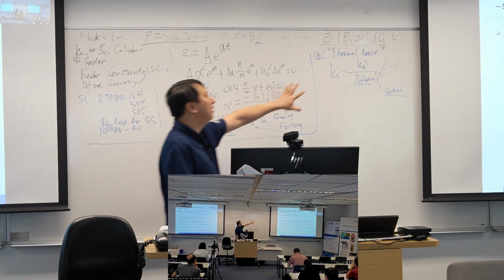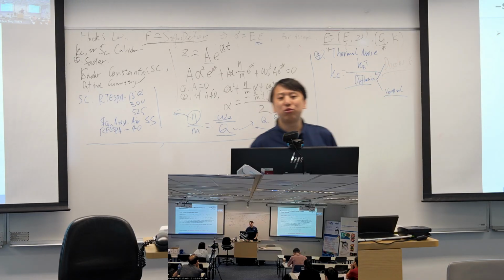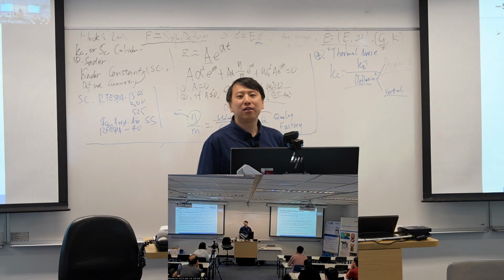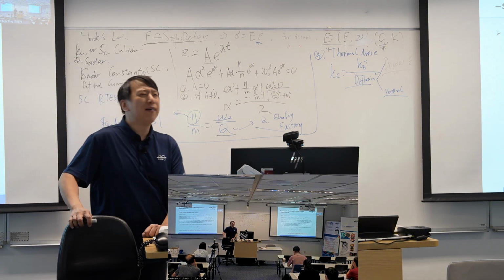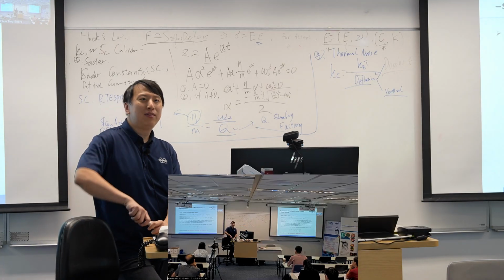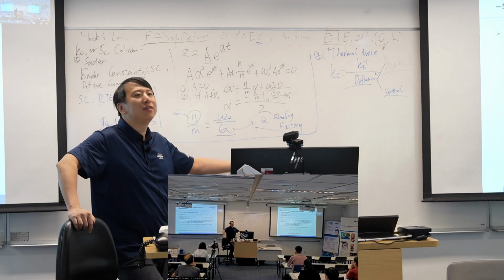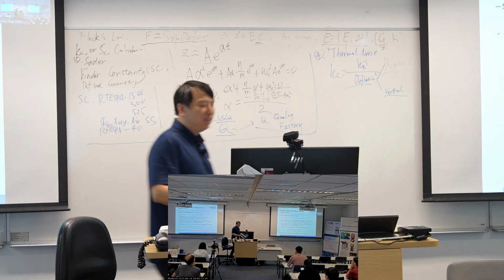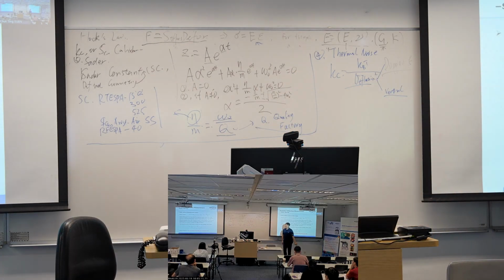The principle is the same. You are using the thermal tune; they are using other instruments to get the spring constant out. Okay, so on Friday, we will use this kind of probes. They have a QR code to scan to get the spring constant out. It's quite sweet because we just skip all this calibration stuff.